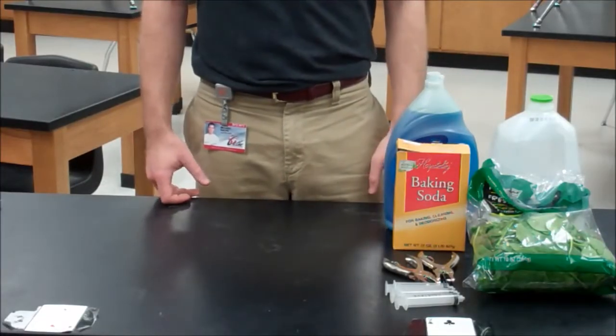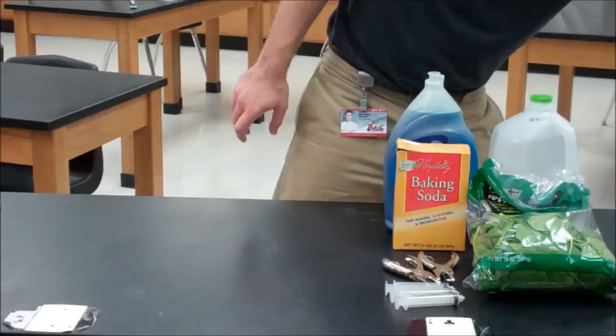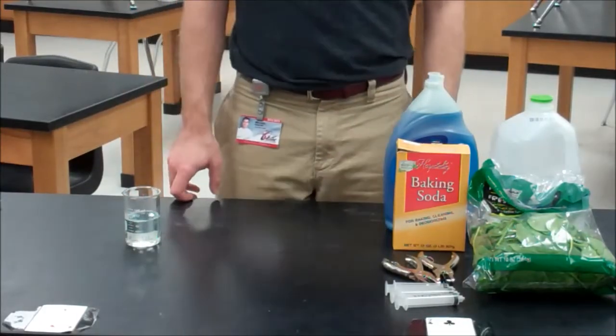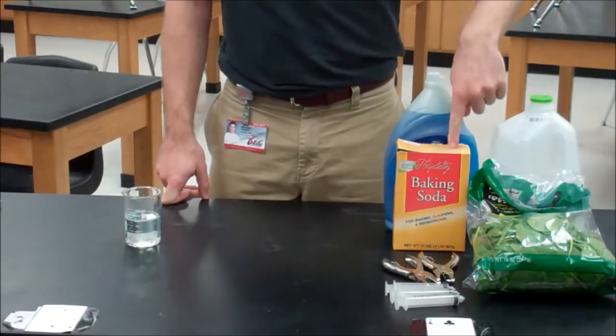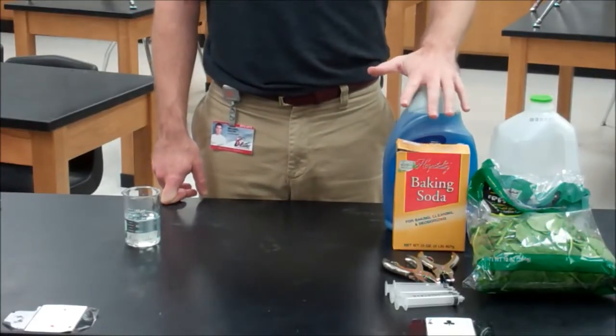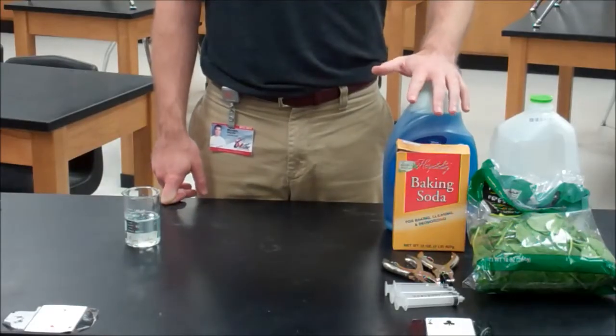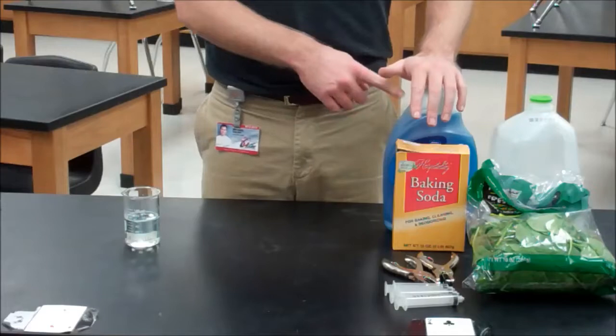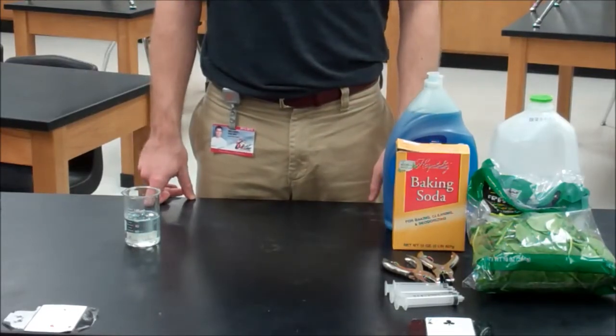The first thing we're going to need to do is mix up our assay solution. Our assay solution should be 1% sodium bicarbonate, or baking soda, by mass with trace amounts of soap present. The soap is going to help get the solution inside our leaf discs, so this is the quantity that needs to be adjusted depending on how well you're getting your leaf discs to sink.